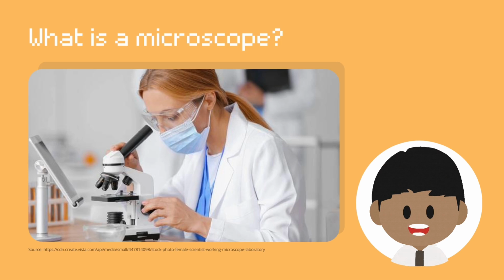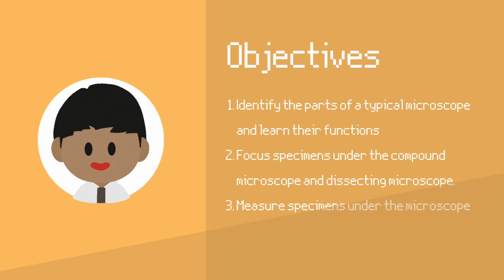Pretty cool, right? By the end of this video, you should be able to identify the parts of a typical microscope and learn their functions. Focus specimens under the compound microscope and dissecting microscope. And lastly, measure specimens under the microscope.